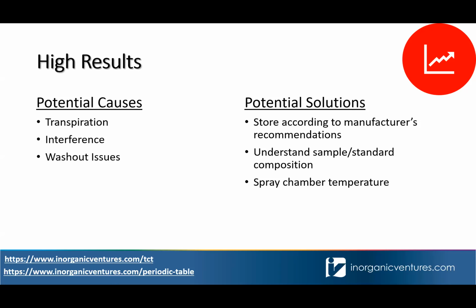You'll see everything low if you don't mix that thoroughly. So if you're trying to avoid transpiration, you could also end up with a situation where your analytes are low unintentionally. Just let that come to room temperature and everything will be fine.